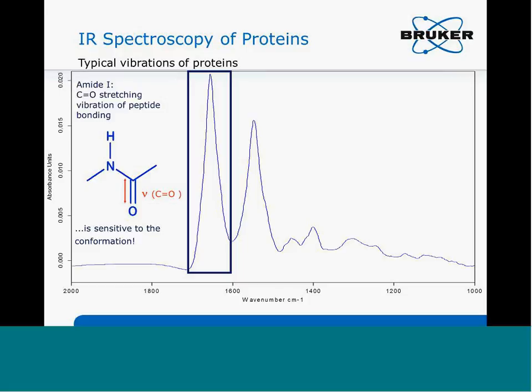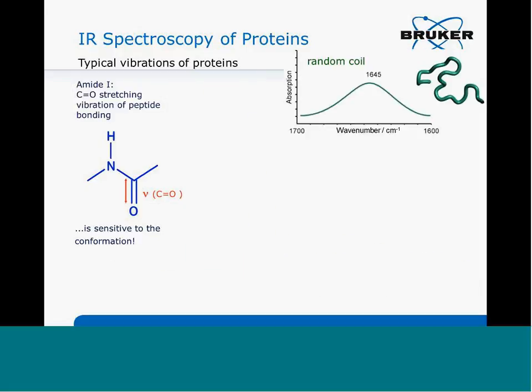That slide shows the typical spectrum of a protein, and if you look at the spectra of many proteins, they look very much alike. Two big, intense bands around 1650 and 1550 wave numbers are called amide 1 and amide 2. The most important band is amide 1, in the 1600 to 1700 wave number range. That is extremely sensitive to the secondary structure. So all analysis based on this band is important.